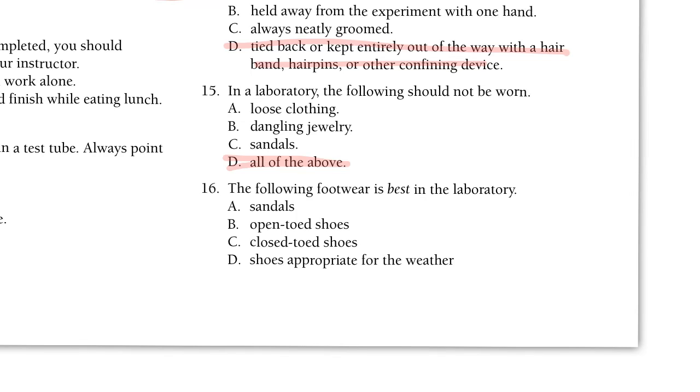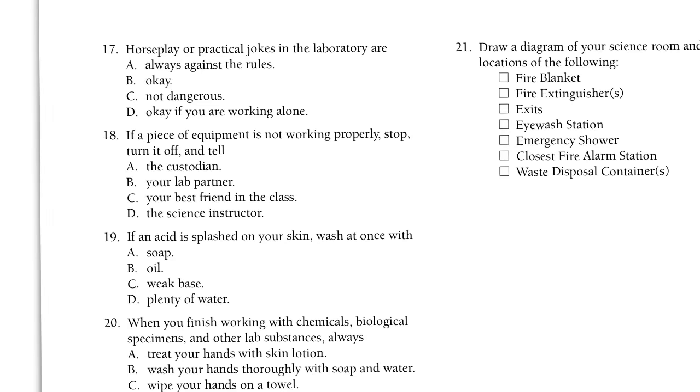Which brings me to number 16. The following footwear is the best: sandals, open-toed shoes, closed-toed shoes, or shoes appropriate for the weather. C. Yes. Horseplay or practical jokes in the lab are always against the rules. Okay. Not dangerous. Okay if you're working alone. Not dangerous. Now, this also becomes an issue. I've had several people I've had to warn and then sit out. And if you sit out, you have the alternate assignment to do, or you come in and make up the dissection on your own time.